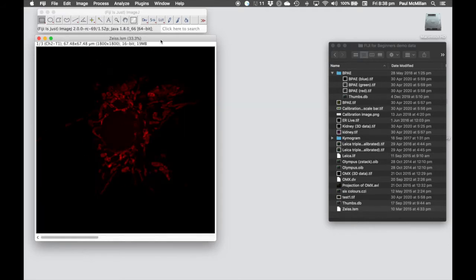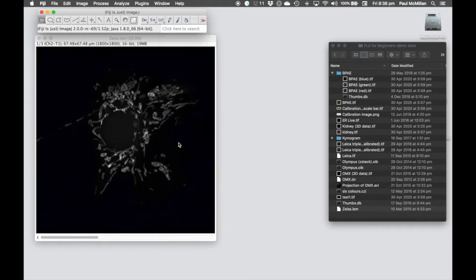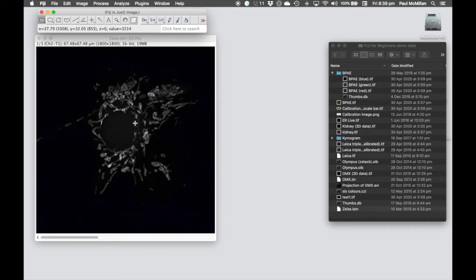What we're going to do is convert the lookup table to something called the High-Low lookup table. The High-Low lookup table colors zero-intensity pixels as blue, any saturated pixels as red, and grayscale in between. You may see a little bit of blue intensity in the background, and at the moment we don't have any red intensity, which means the data wasn't saturated when we acquired the image.